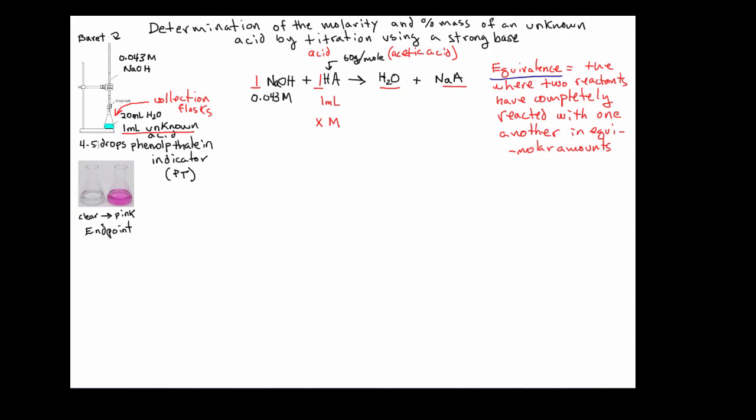All right, now, if this is a really basic chemistry class that you're taking in a really basic lab, the teacher may not tell you exactly why the indicator is changing color. And truthfully, it doesn't really matter if you're in the lower level class. You just need to understand that this molecule will change color at a designated place, and that is what's going to tell you where the end of the reaction is.